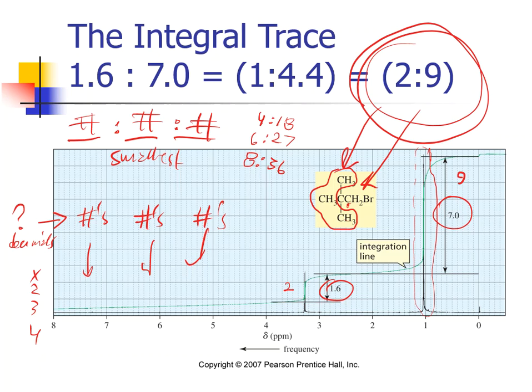That ratio is the base. It is the foundation of the different types of hydrogens that are in a molecule. And it will be a simplified version every time. The reason 2 to 9 worked out here, well, it just so happened to work out. It just so happened to match. And that's where the confusion happens. Most people think, when you do this calculation, that ratio should be identical to the number of hydrogens that are in the molecule. And there are times where it will not be a perfect match that way. And that is okay. We accept that fact, right?